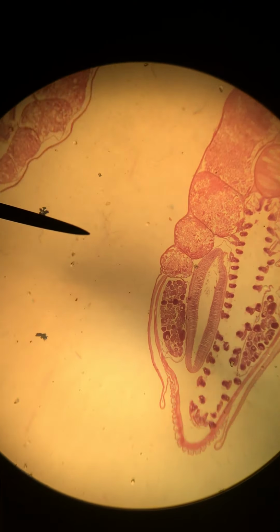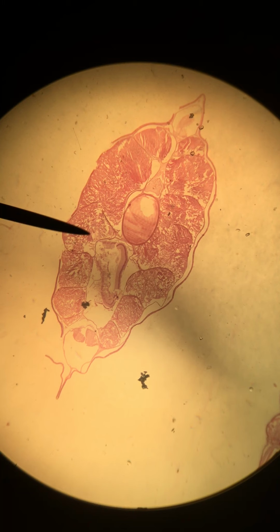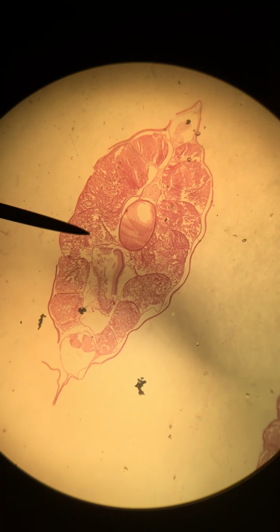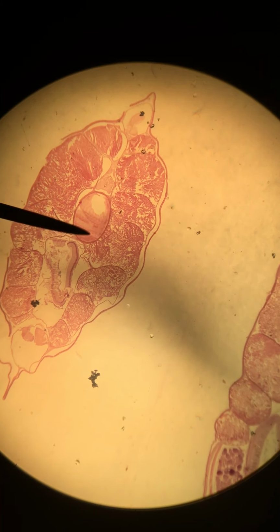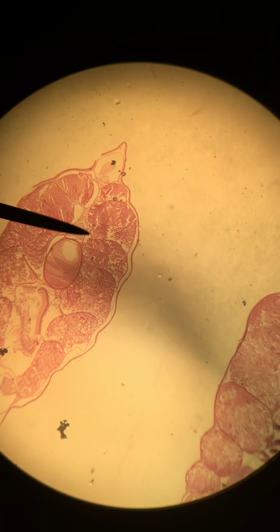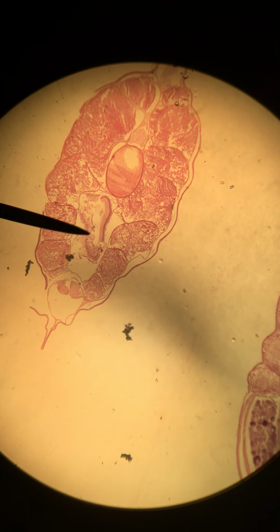and then move caudally. So this is the next slice through the body of the Amphioxus, the next cross section, and it should look a lot like figure 12 in your lab manual. Of course we've got lots of myomeres, myosepta. We still have a nice round notochord and a dorsal nerve cord. And now in the abdominal region, we can see the intestine.